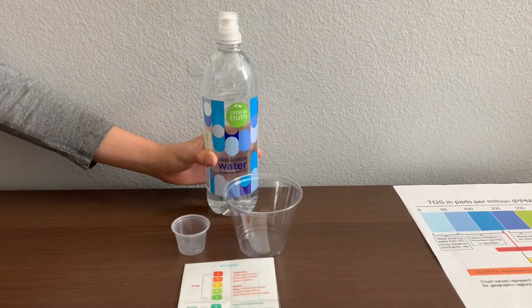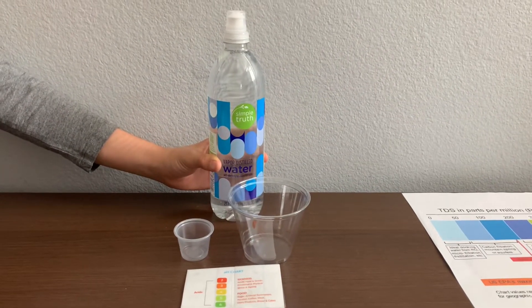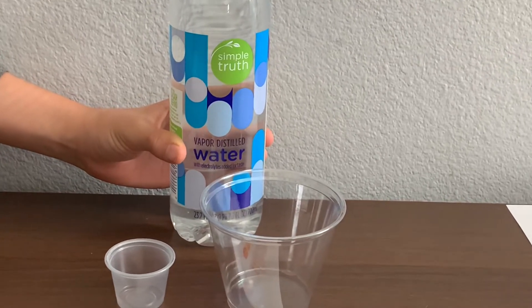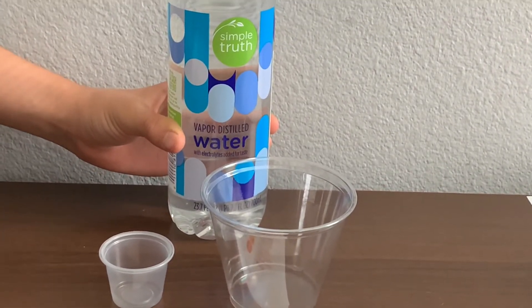This is Simple Truth vapor distilled water with electrolytes added for taste. It's processed by steam distillation and it's sold at Smith's market for $1.